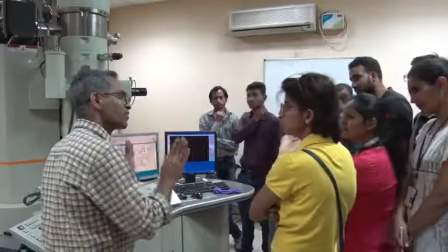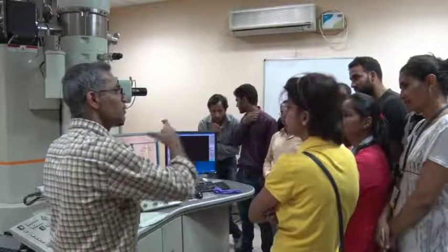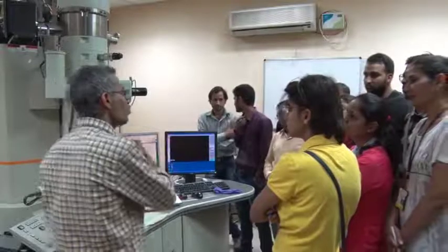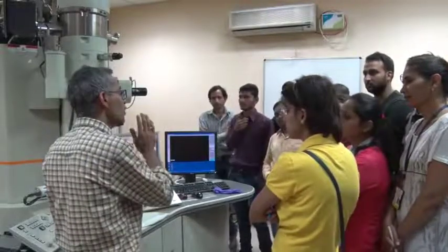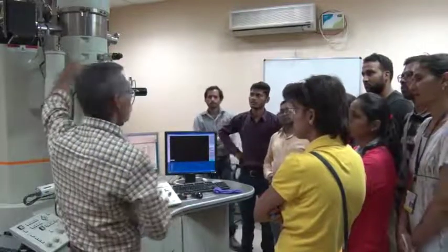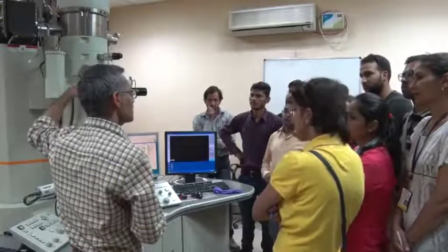No, not sample temperature. That would mean that you have a cryo holder, so this is not that. This is, however, not cooling the sample itself, but it is cooling the chamber in which the sample is there. So this will improve the vacuum locally, and also it will prevent contamination of the sample.